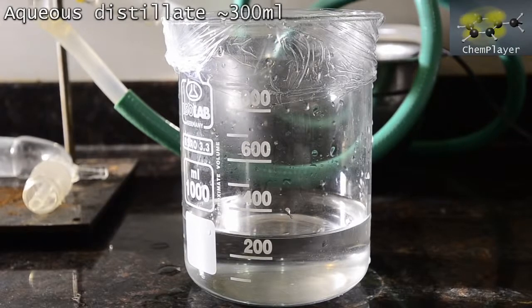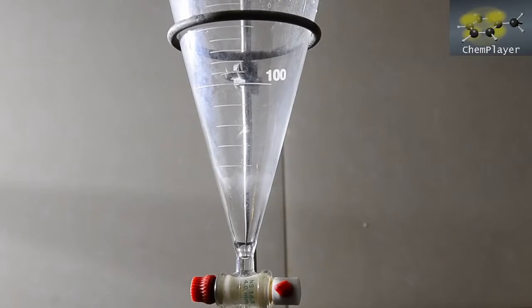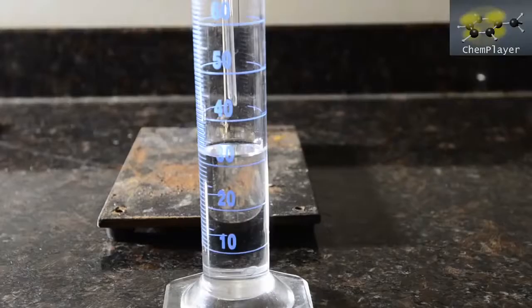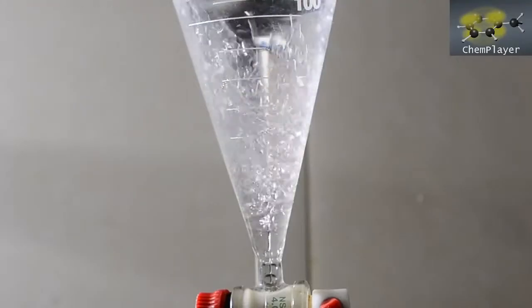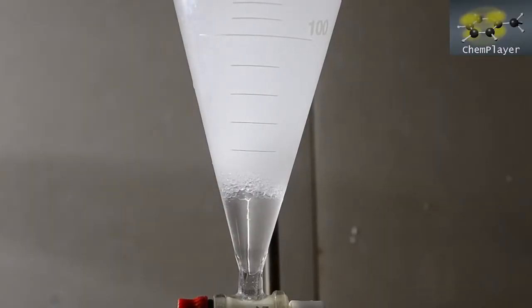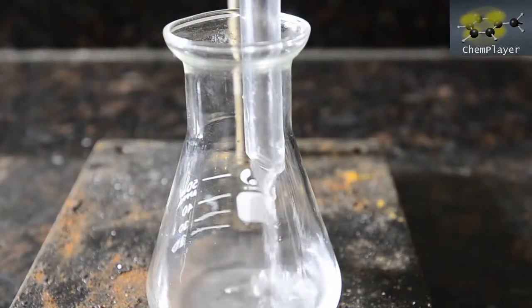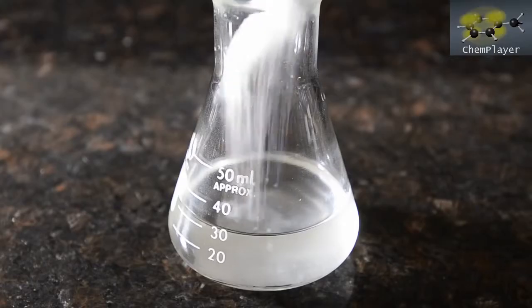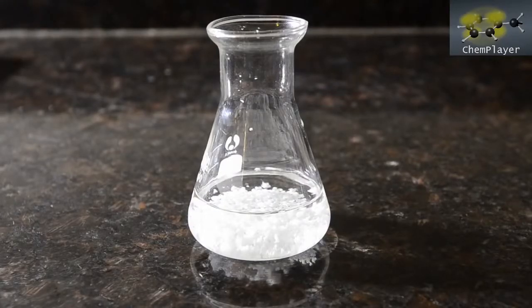We've got about 300 ml of distillate. We first wanted to see if we could extract anything out of this using an organic solvent. So we put the mixture into a separating funnel, and then tried extracting with 30 ml of dichloromethane. After a whole minute of shaking we allow it to separate and then drain off the DCM bottom layer. We then dried the DCM using magnesium sulfate and then evaporated off the solvent on a hot water bath.